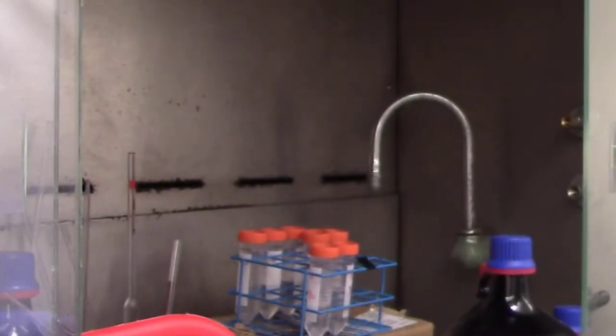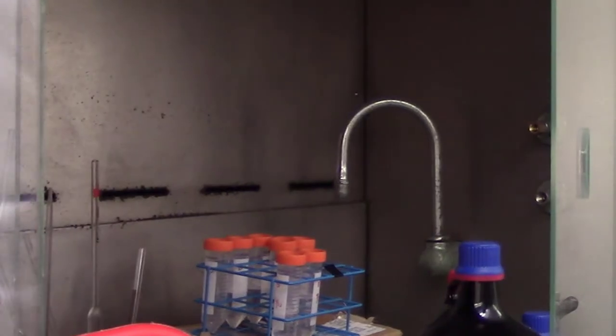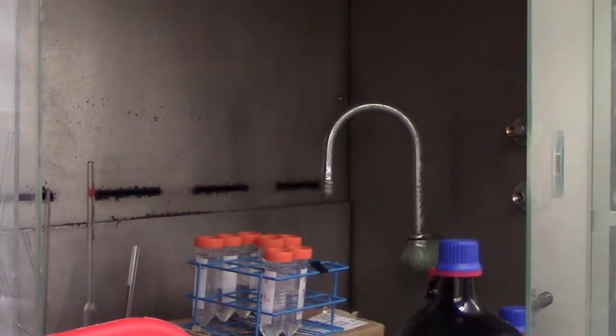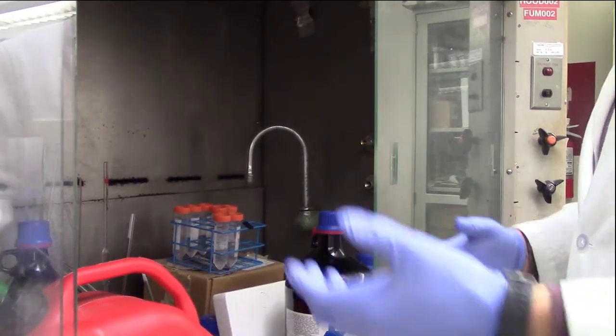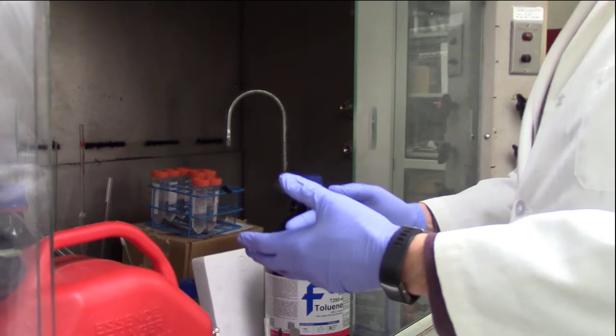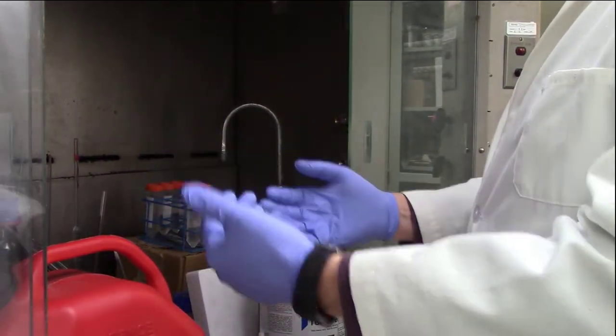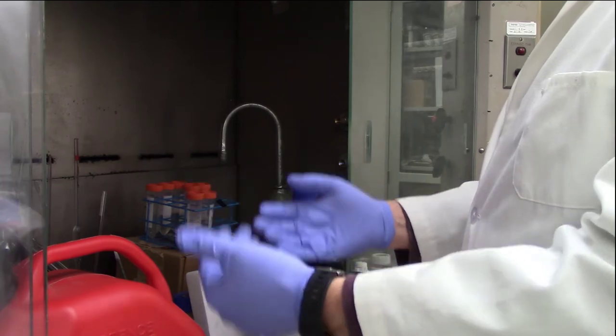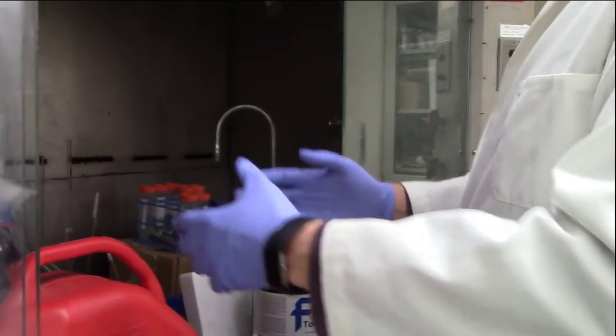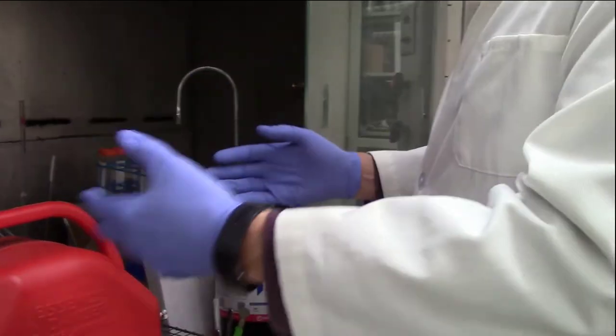We have a number of containers with toluene, we have some needles here that could be in the way of working, and so this laboratory hood is too crowded to actually do the work that we need to do. So before we would do any work in here, we would need to clean this out, store these chemicals safely elsewhere, and then create a workspace that would be safe and easy to work in.